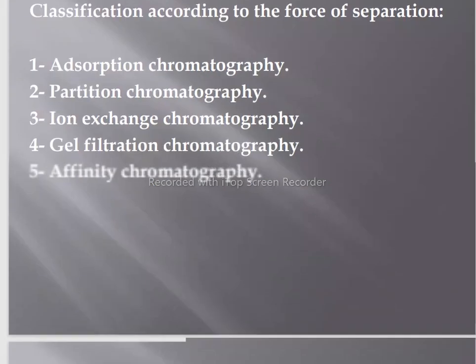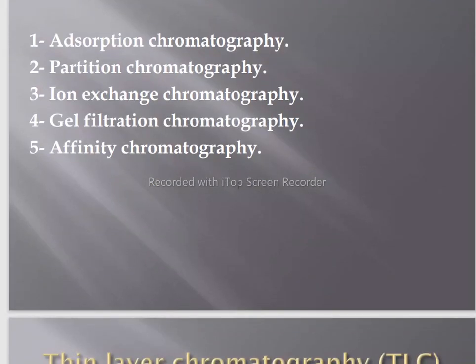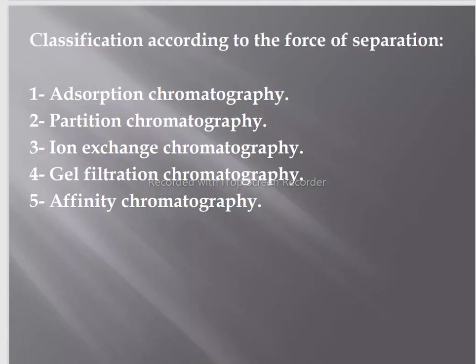Okay friends. So next, classification according to the force of separation. As per the force of separation, it is classified into five categories. The first one is adsorption chromatography, second is partition chromatography, third is ion exchange chromatography, fourth is gel filtration chromatography, and fifth is affinity chromatography.